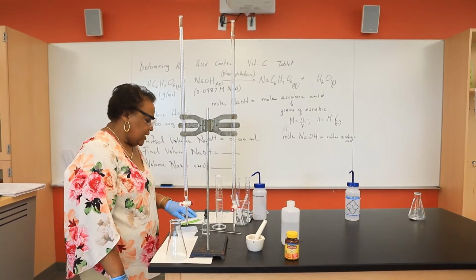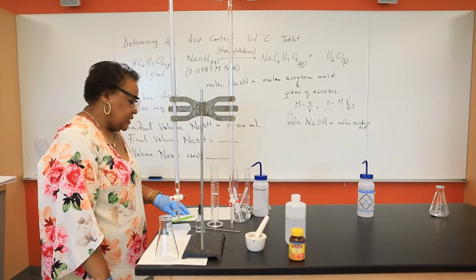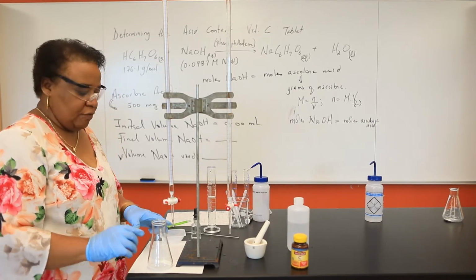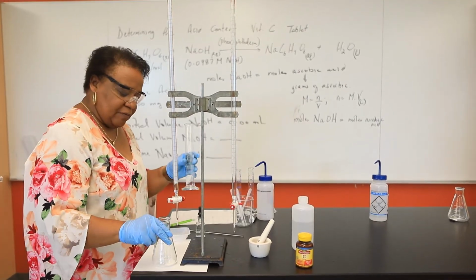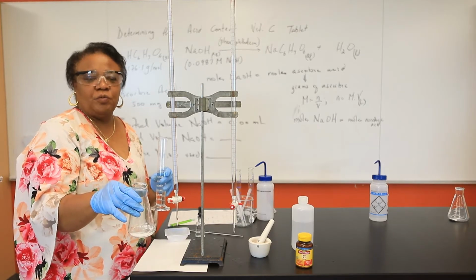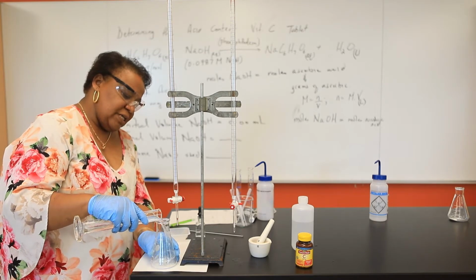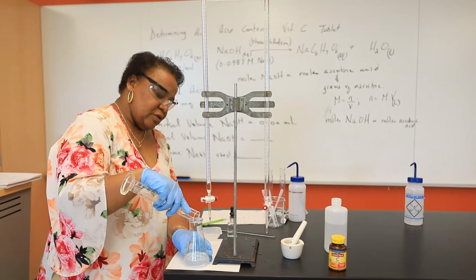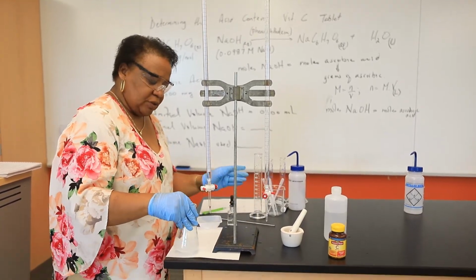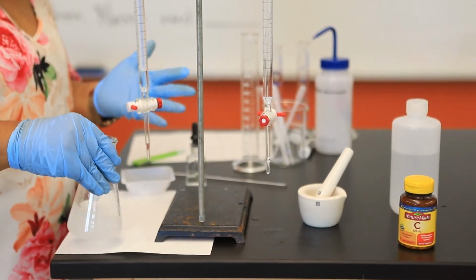And then when I added the tablets, the new mass is 141.687 grams. That's for our first tablet. Now, the next step: it's going to be impossible for us to do this titration with a solid. So we're going to take a few minutes to dissolve the tablets in 75 mLs of water. I also need you to note that there's a good chance, you should expect, that not all the solid will dissolve.